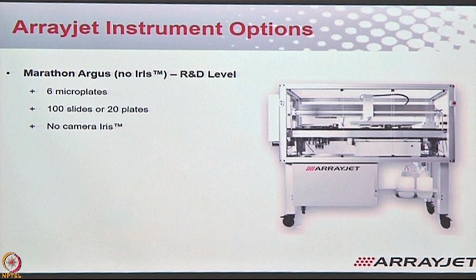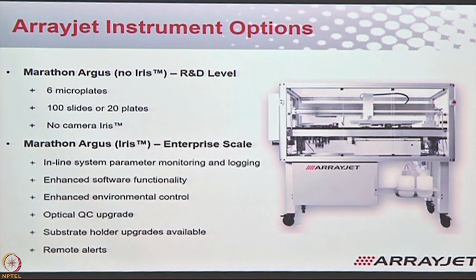It's got glass panels, so it's quite easy to see what you're doing. You can actually see the spots getting printed. This is the space here. These are the 2 bottles I'm showing you where you can prepare your own glycerol buffer. And that's all that is needed. So you have your glycerol buffer in the system, you put your slides, you have your 384 sample plate here, you have your slides printing here, and that's it. So it's quite easy. It's really quite easy.